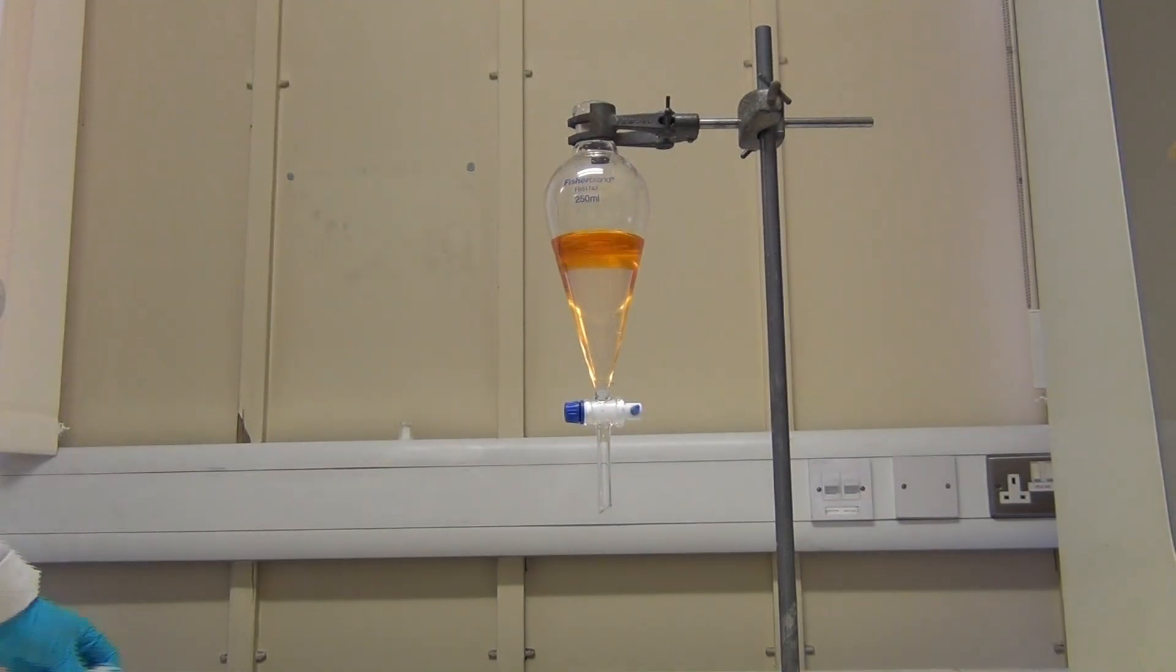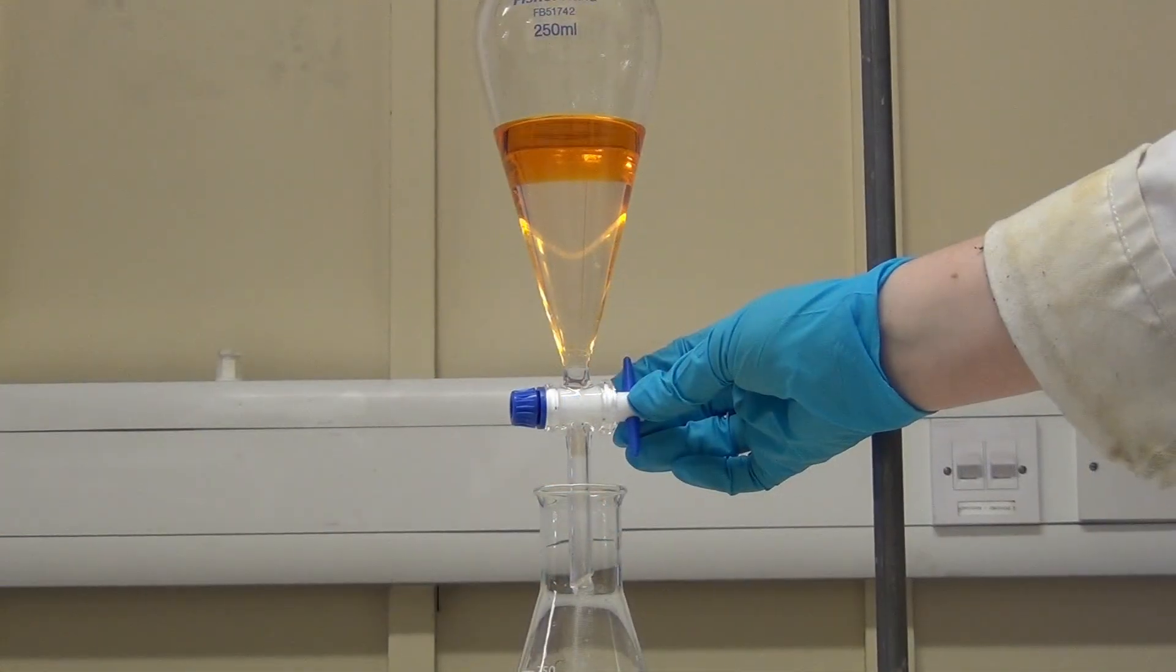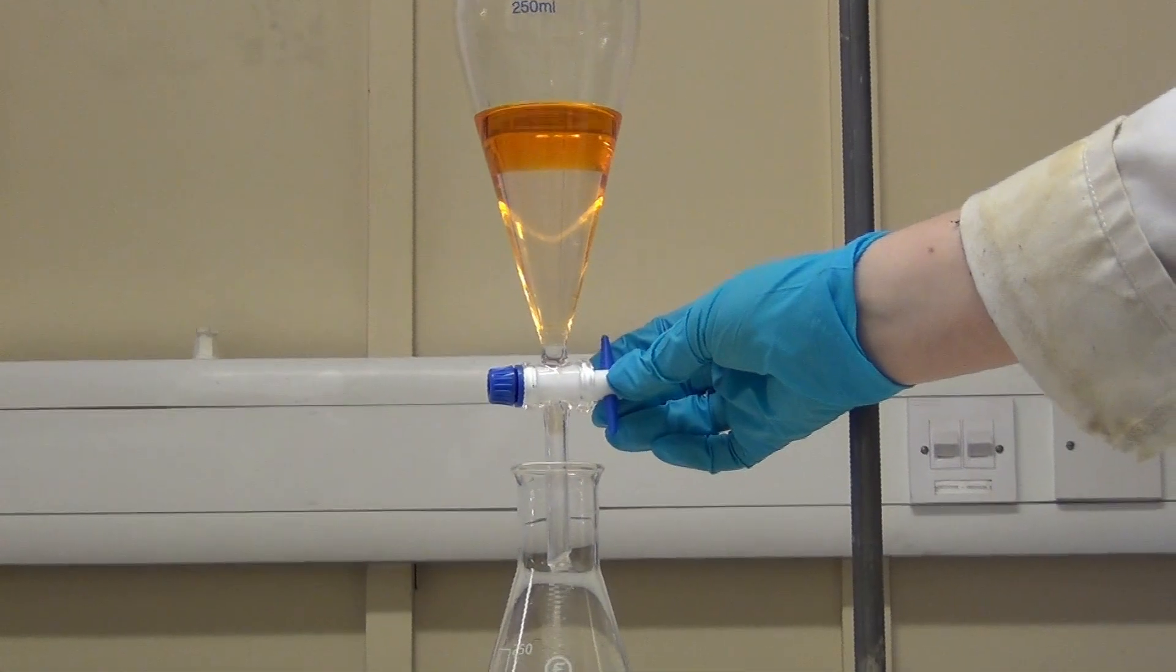Always start by removing the stopper from the top of the funnel. Open the tap and drain the first layer into a clean, conical flask.